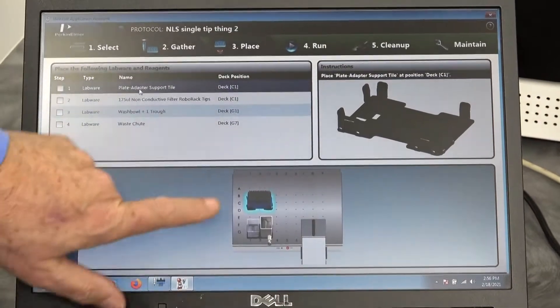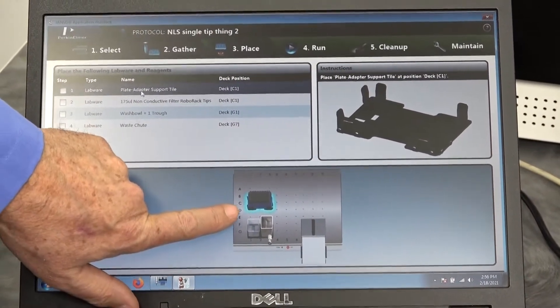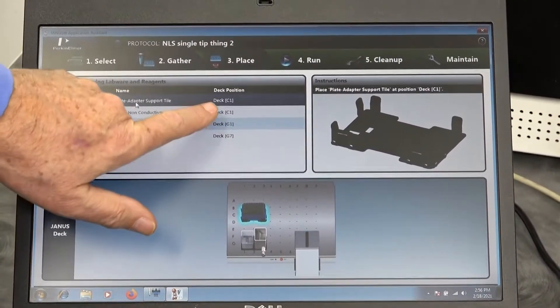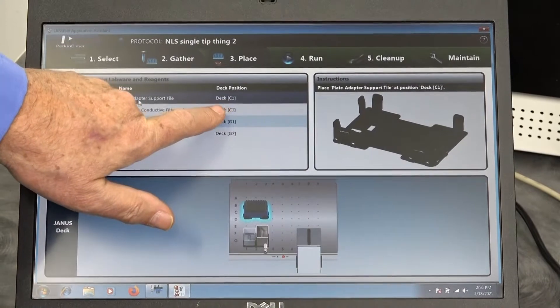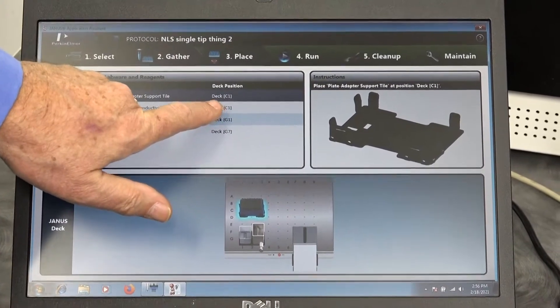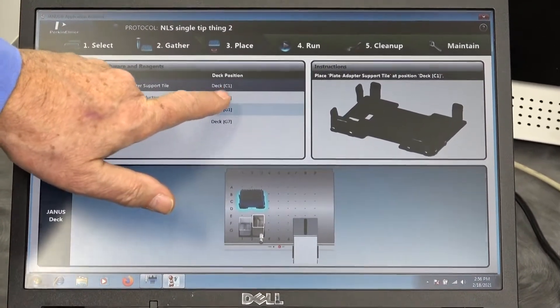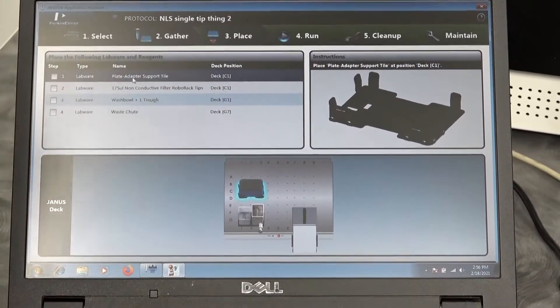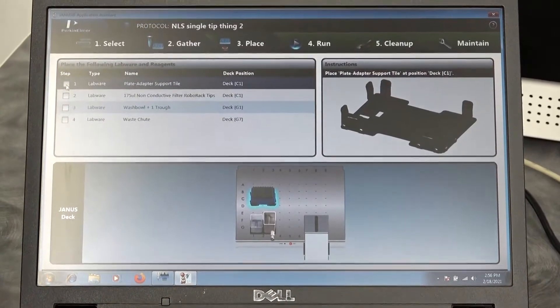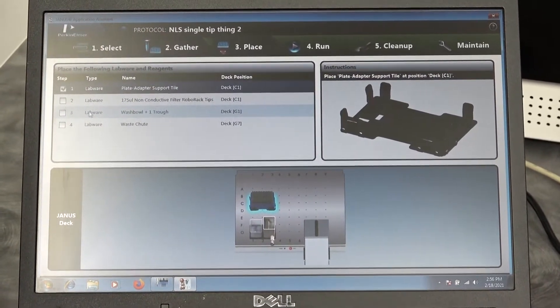It'll show them what the picture is, highlights on the deck where it goes, what numbers, what position on the deck it's to go. And again, it has a checkmark system.